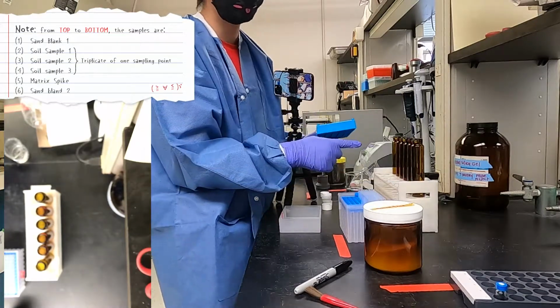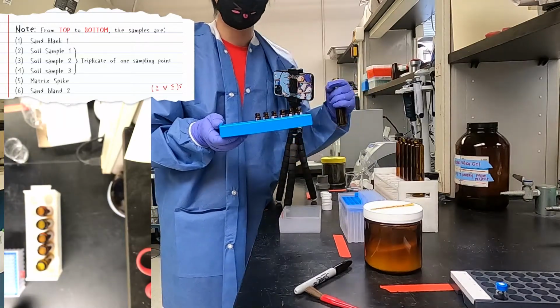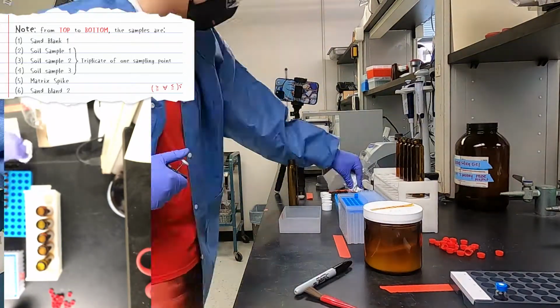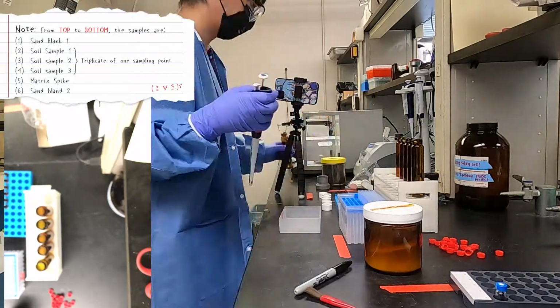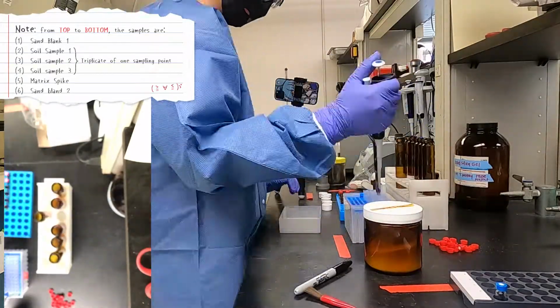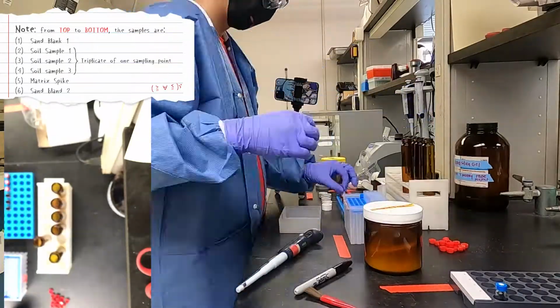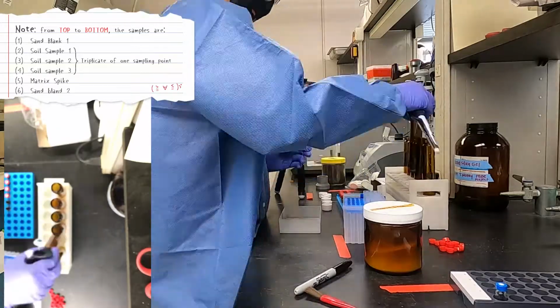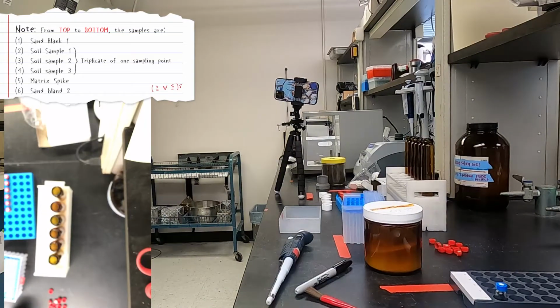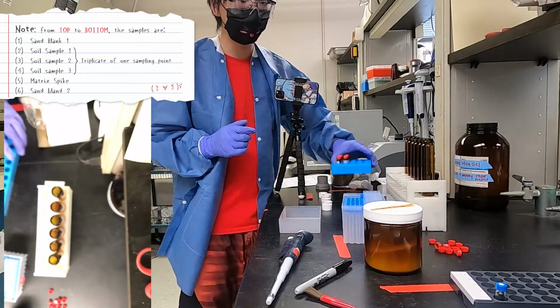Because we have 2 milliliters of sample in the vial, for each GC vial, we transfer 1 milliliter. And so now we have prepared all the samples for the GC analysis.